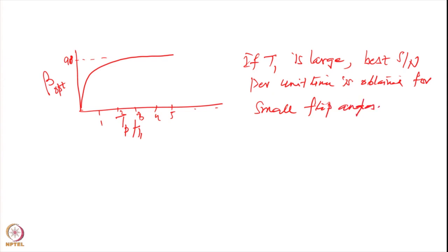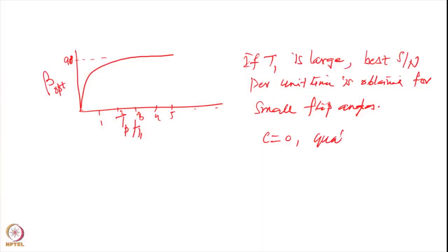So carbon 13 relaxation times are very long. Carbonyl, for example, has a very long relaxation time because it has no proton attached to it. Similarly, whenever there is no proton attached, you have quaternary carbons. They have very long relaxation times. So these are, for example, carbonyls or quaternary carbons.